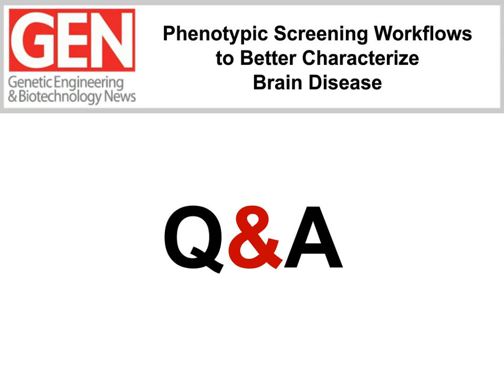All right, thank you very much for that one, Satish. Dan, is the acapella script for spatial analysis commercially available? It is currently not, but as I understand from PerkinElmer, it will be one of the advanced building blocks that will be released in an upcoming version of Columbus and Harmony. All right, thank you, Dan.